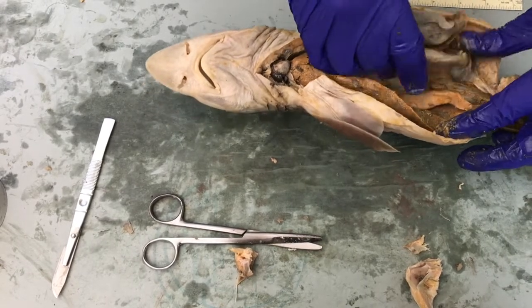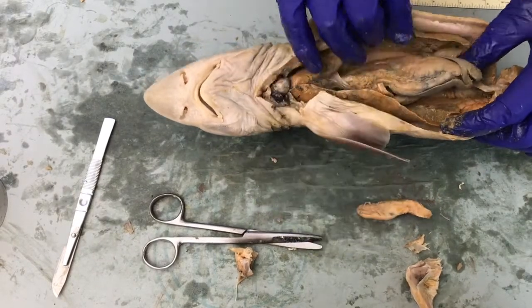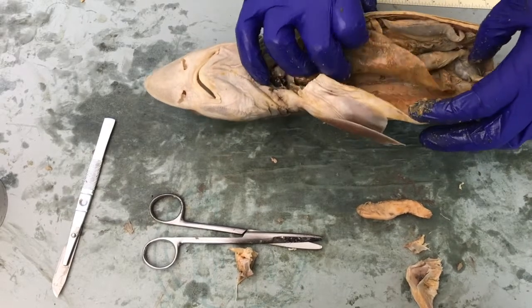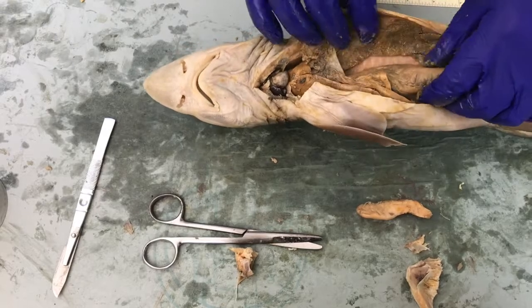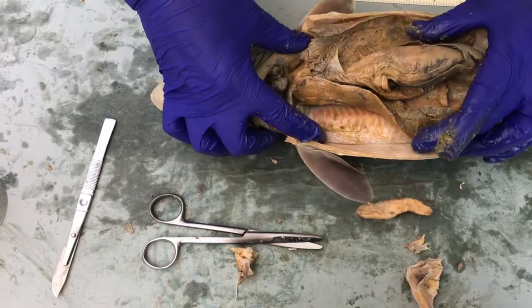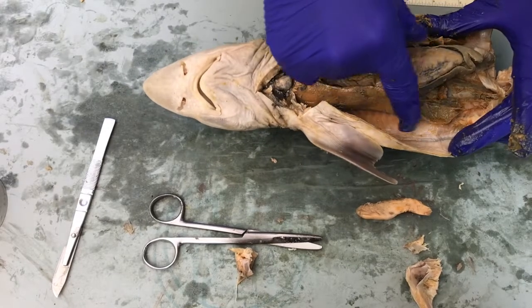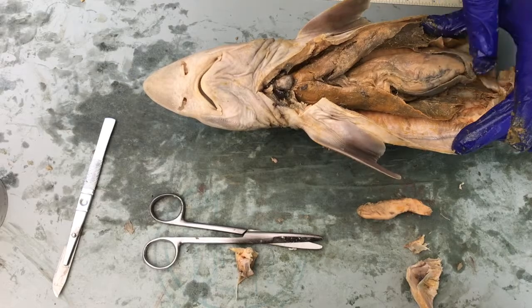This is a male, and they've kind of come off here, but the testes, so we can actually get the testes. It should be a paired organ, so there should be another one in here somewhere. But those are the main organs that we're going to see there. Again, we've got the heart up there. We've got the liver, the stomach, which has something in it, the spleen.